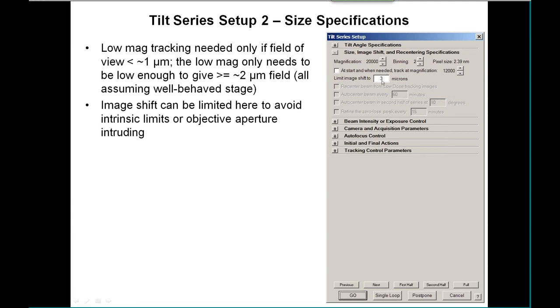This is the place to limit the image shift that the program will allow during the tilt series. This is needed if you have intrinsic limits on the image shift or if the objective aperture intrudes at a certain point.